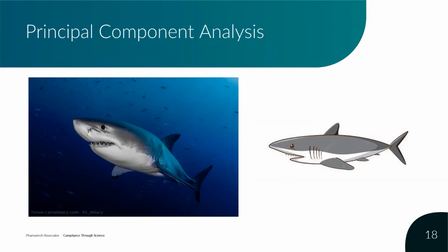And these techniques of principal component analysis and partial least squares do provide for those issues to be overcome. And as I said on the previous slide, there are many others that have been used. I think the Misra article is an excellent review of these techniques, and there are references that will be listed at the end of this presentation.